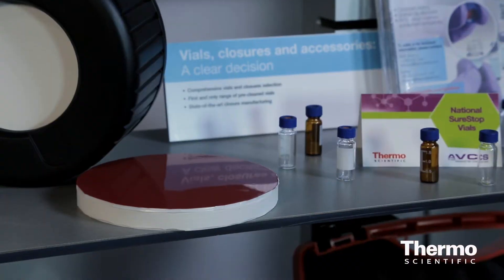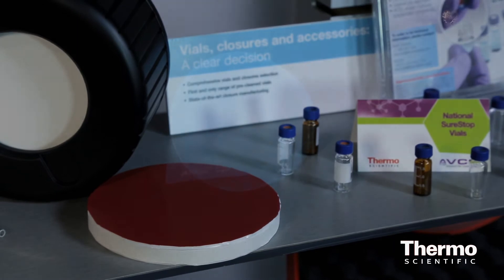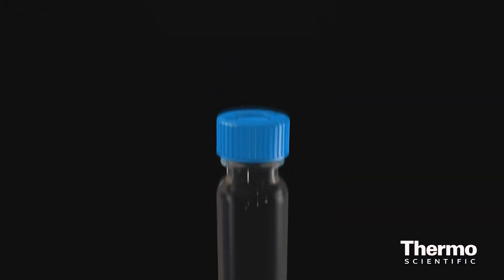The second item we're introducing is our Thermo Scientific SureStop nine millimeter screw thread vial. This is also part of our AVCS technology. This SureStop vial has a compression ring, and what that ring does is allow the user to have an identification point of when that SEPTA and that cap is optimally sealed.